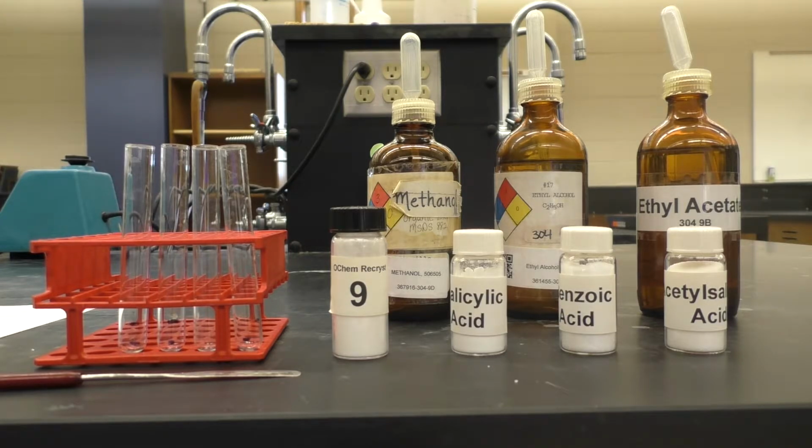We want a solvent that the compound is insoluble in at room temperature, but then becomes soluble in at elevated temperature. And so we don't want something that's very soluble at room temperature. We need something that only becomes soluble at higher temperatures to be able to do a good recrystallization, so that we have large differences in solubility at room temperature and elevated temperature.